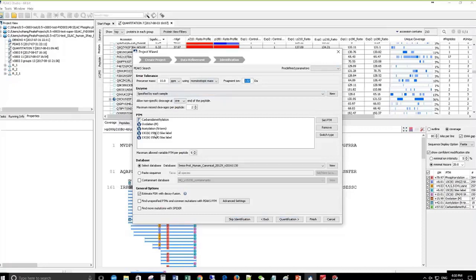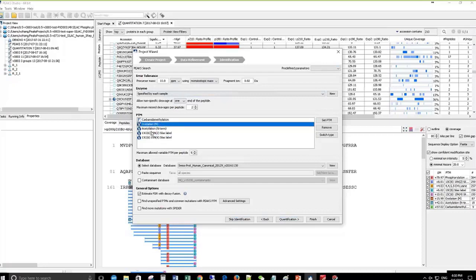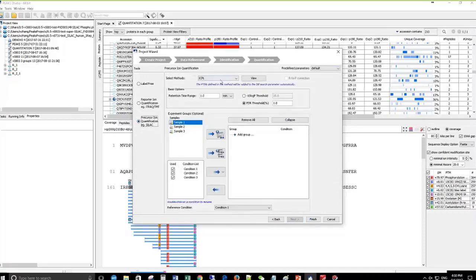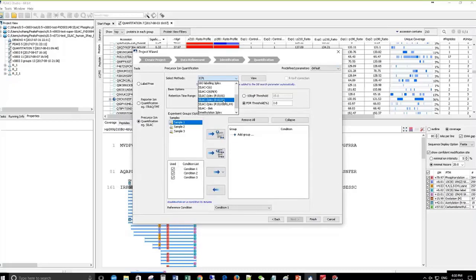The heavy proteins were labeled with lysine-8 and arginine-10. In the variable PTMs, we include these two SILAC labeling states and some common modifications that occur during sample preparation. We use the Swiss-Prot Human Canonical Sequence Database for the database search. In the quantification setup, you choose precursor ion quantification for SILAC. In the method, we have a default SILAC two-plex with arginine-10 and lysine-8, so you just need to select this default method.